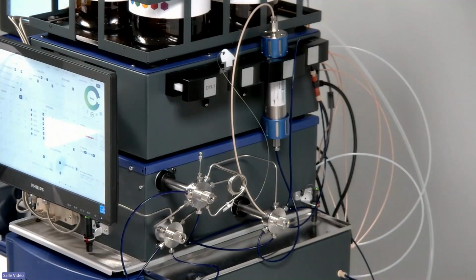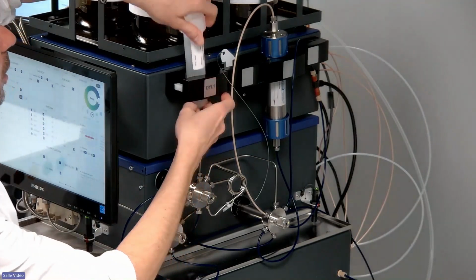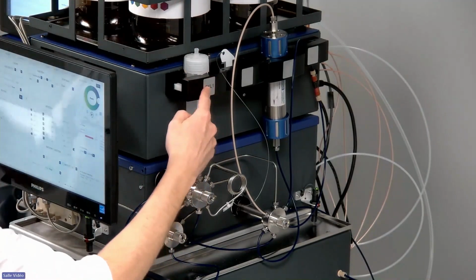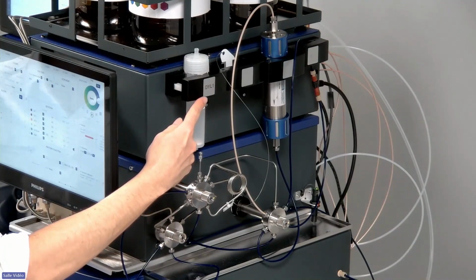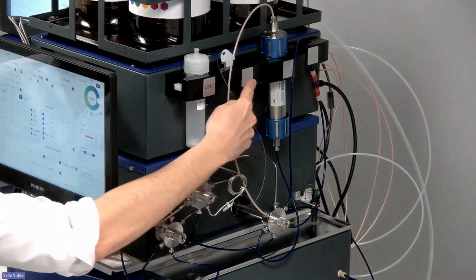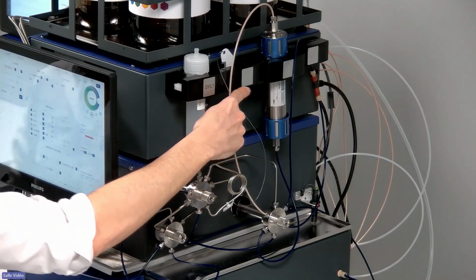And I can replace it by a dry load. We have two positions on the system for the dry load. This is the column holder for the dry load number 1, and we also have another dry load holder for the column number 2.